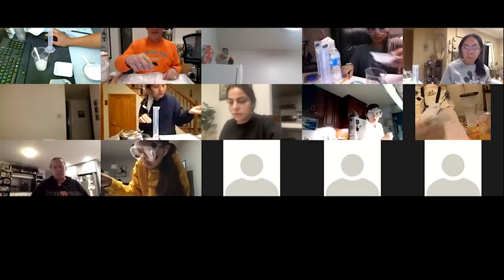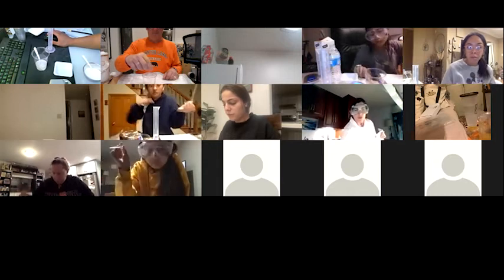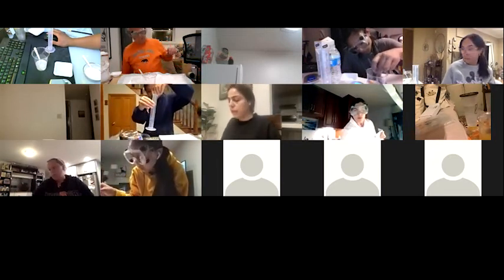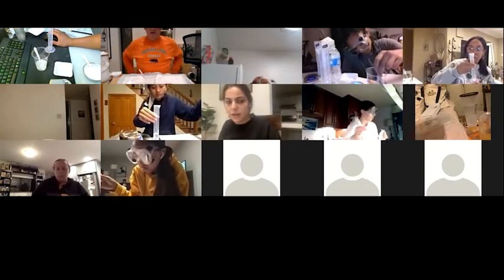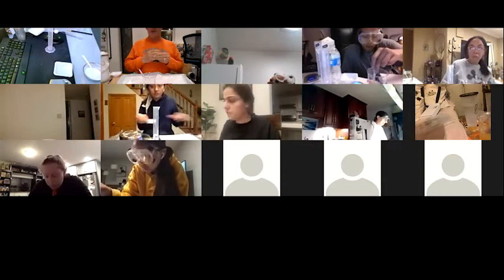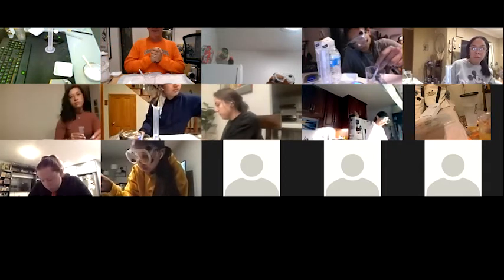Professor, I have a question. Sorry, I'm a little behind. After we put 50 milliliters of water, no, 50 grams of water, what do we do after that? Then we add our sugar. Okay, we add 5.5 grams of sugar? You should know because it's in the procedure. And you've read it, of course.